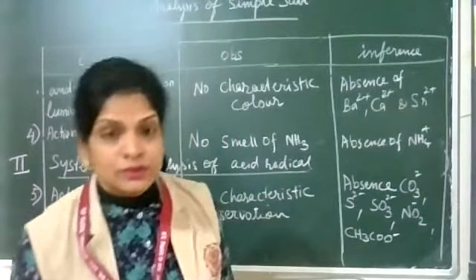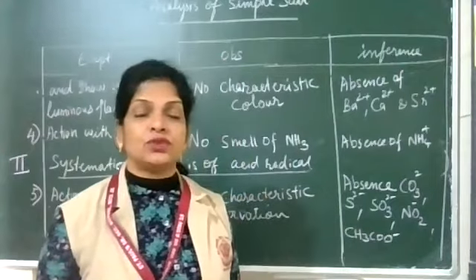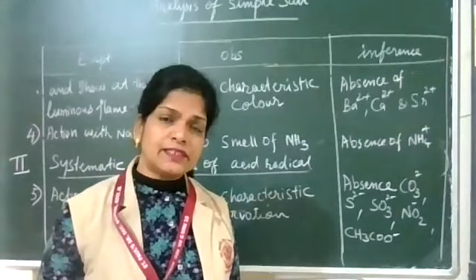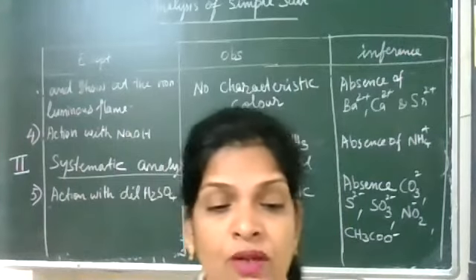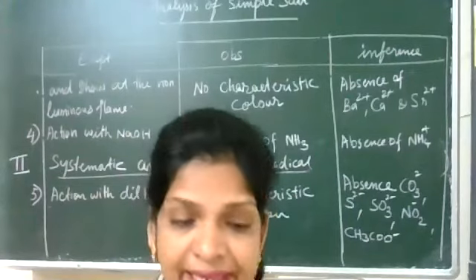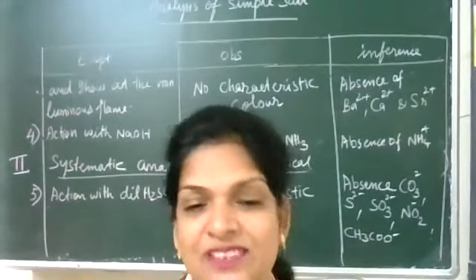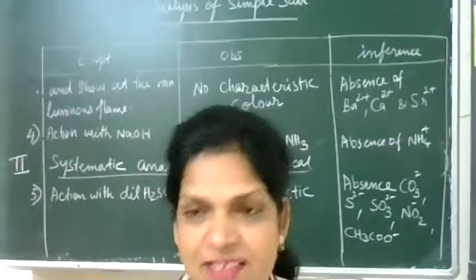So we are going to concentrated H2SO4. After adding concentrated H2SO4, you have to warm the test tube. There you are expecting what all things? Chloride, bromide, iodide, nitrate, and oxalate. But our sulfate, in that also we are not seeing our sulfate. That means we are not going to get any observations in this category.